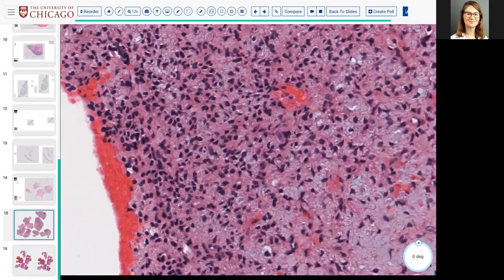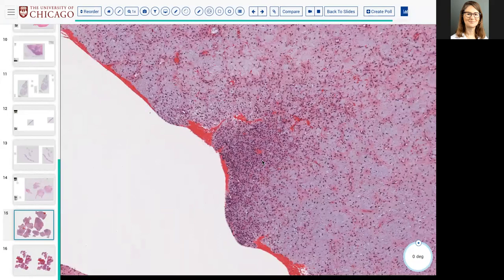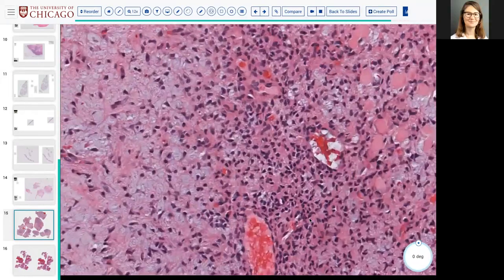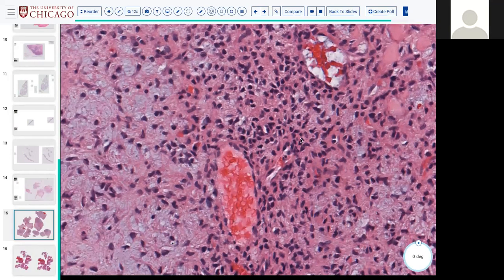Yeah, so I'm gonna say if these are the areas you're thinking about for small round blue cell tumor, I would agree that these areas, while they are more cellular, are not the predominant morphologic pattern here. And one could argue that I'm not even sure they're entirely round. They're small and bluish, but kind of pointed and kind of separated by some stroma still, right? Still.